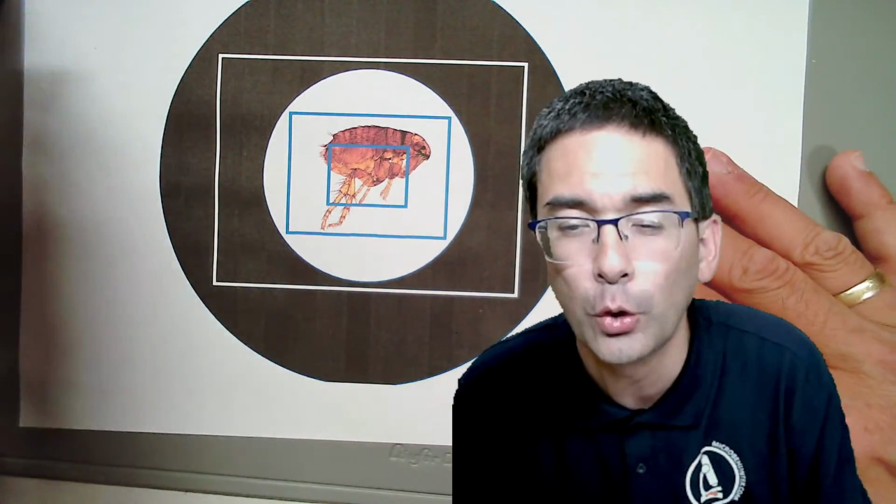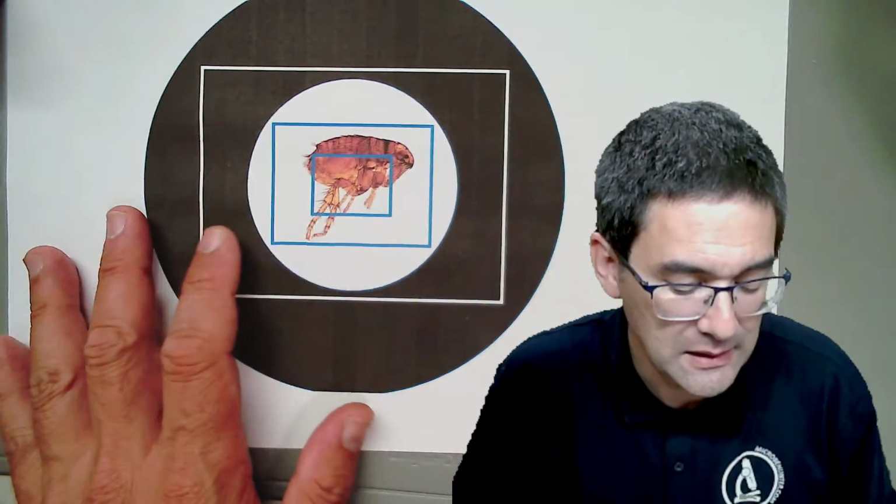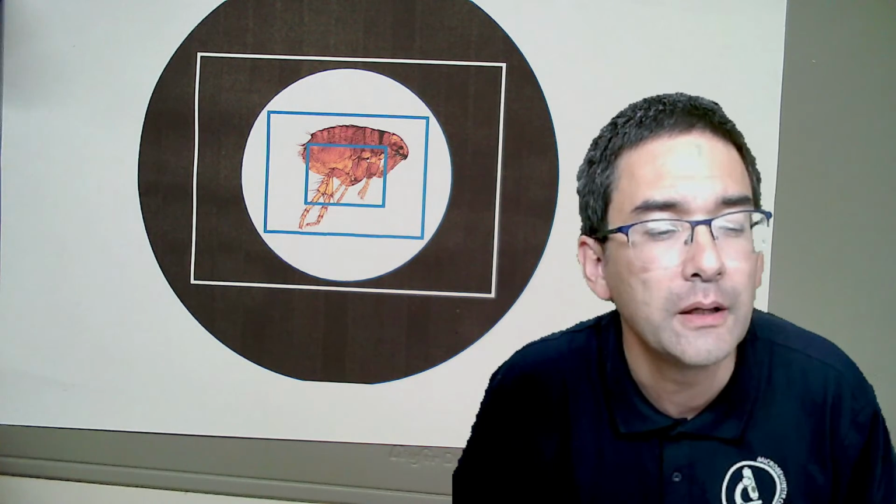So I would like to first explain the field of view a little bit, because this is going to be a recurring topic that keeps reappearing over and over again. But just quickly, let me check over here. Okay. Just wanted to double check something, yes.